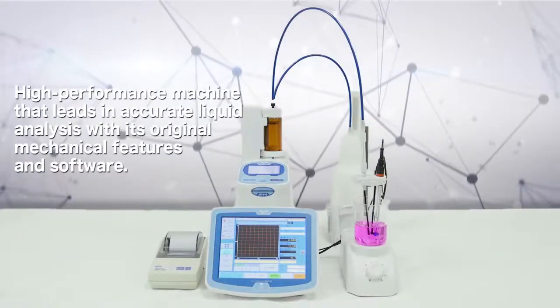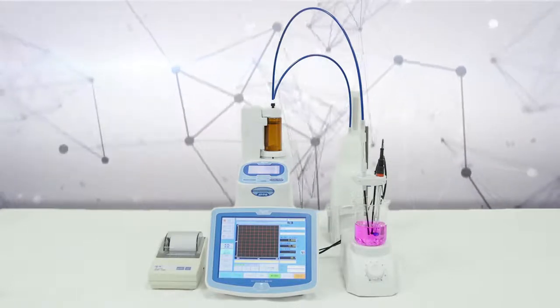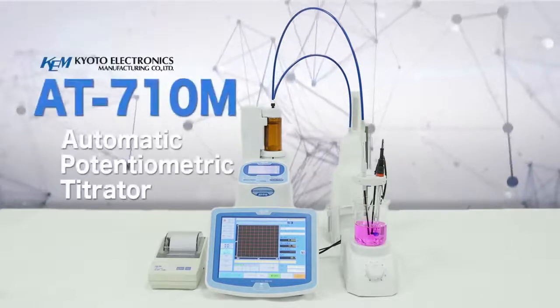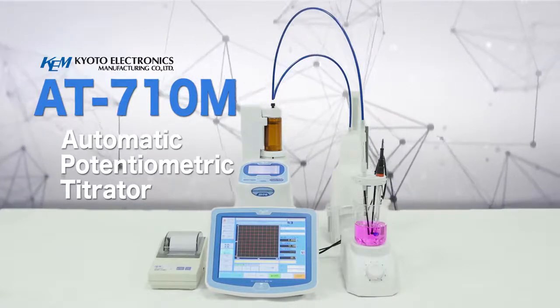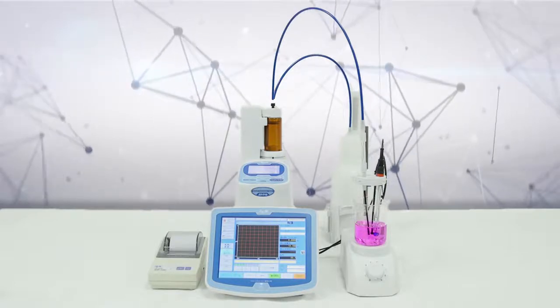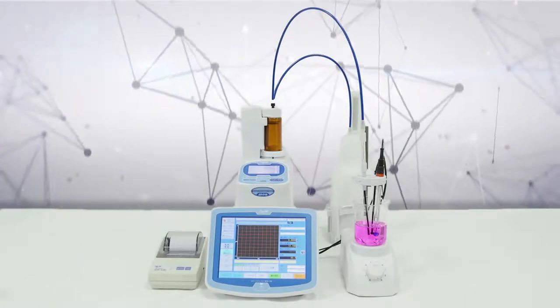A high performance instrument that leads the industry in the precision analysis of liquids and soluble solids using mechanics and software. The AT710M, in addition to measuring acidity and salinity, can be used to perform various concentration analyses with a high degree of accuracy and reproducibility.